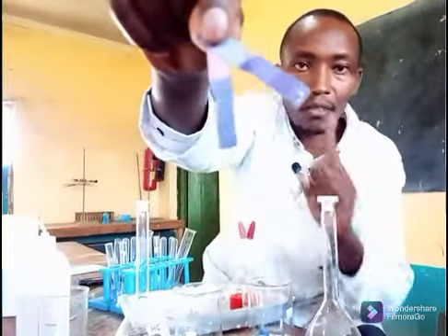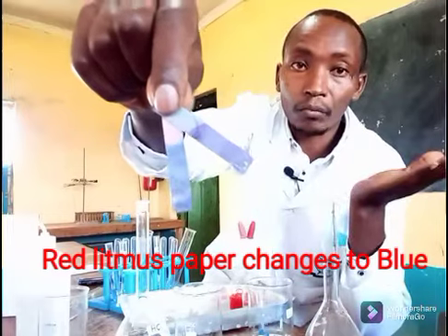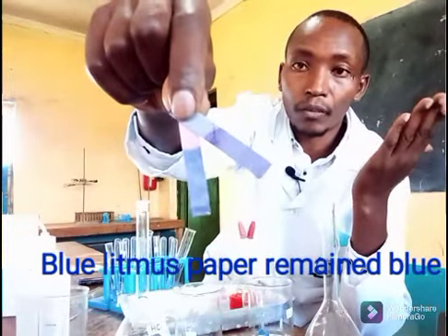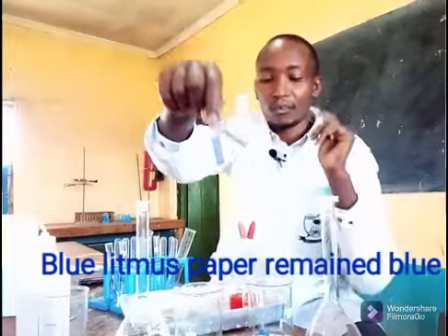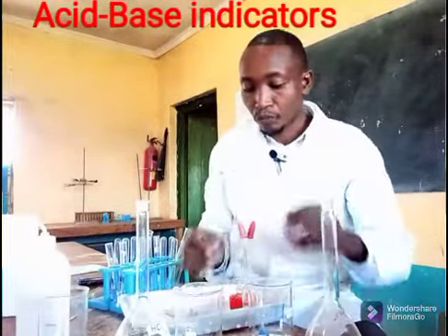What exactly has happened? The red litmus paper changed to blue, or assumed a blue color. The one that was red has changed to blue, the blue one has remained blue. That is one thing. This is not magic, it is basic chemistry.